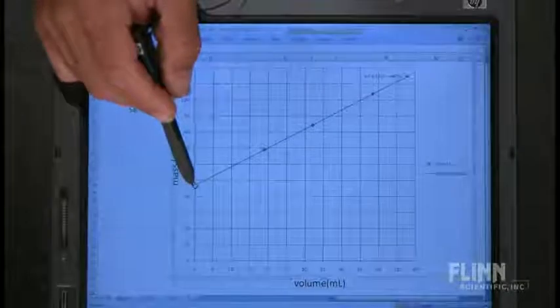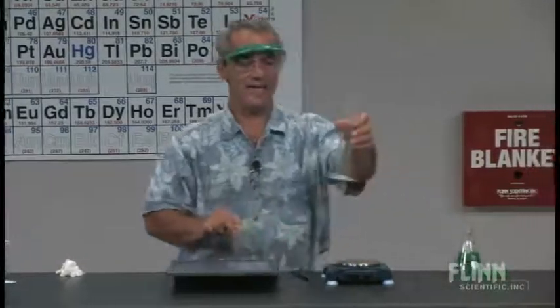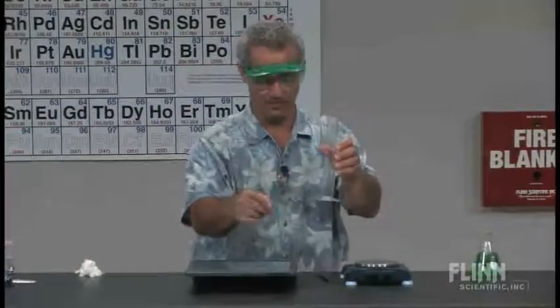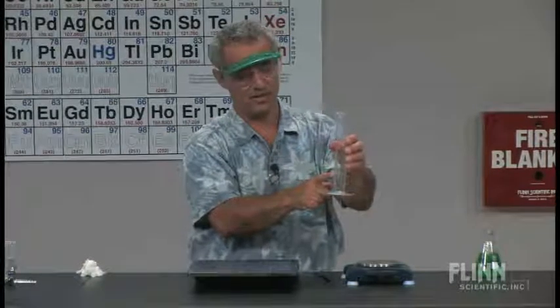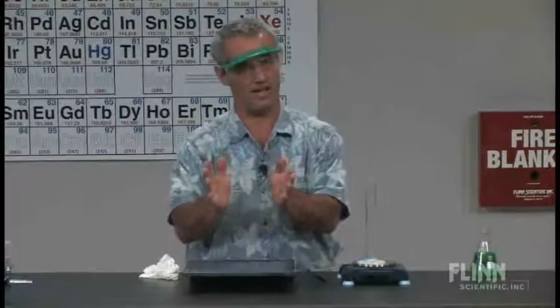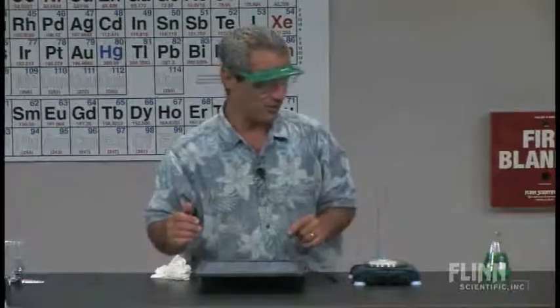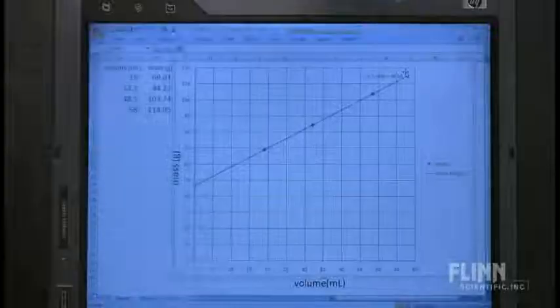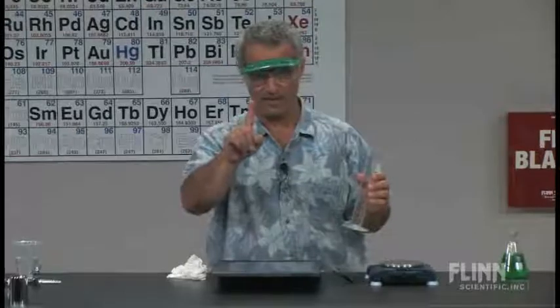It's not going to be that precise, but we'll see. If they came up to me with their prediction written down — say, 46.5 grams — you might notice there are some little drops on the cylinder. In a normal lab, who cares? But their grade depends on it, so they'll be in there with paper towels drying it out. I give them a range of about ±0.5 grams either way. I'm getting 47.02 grams. So we're within half a gram — that's pretty good at this level of precision, and that would give them full credit. That's target number one.